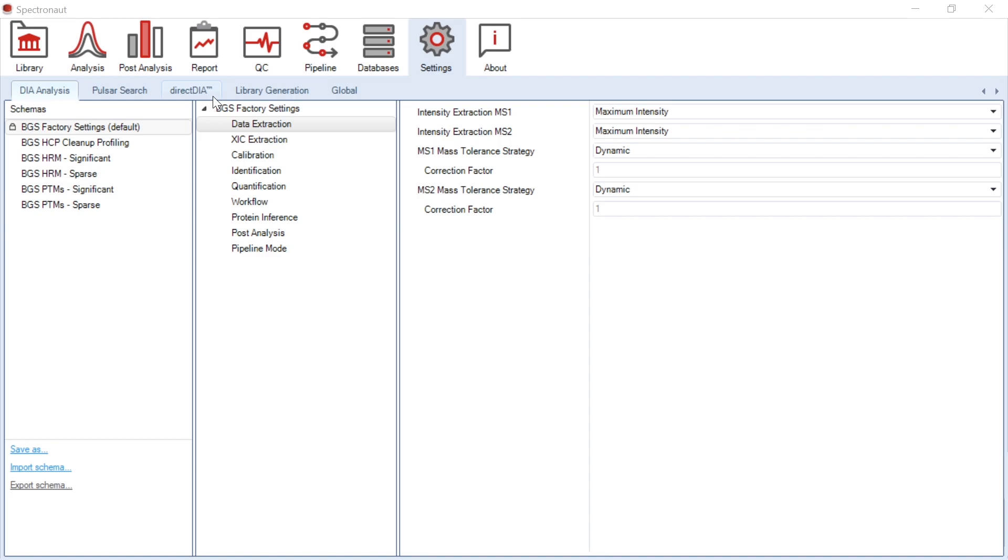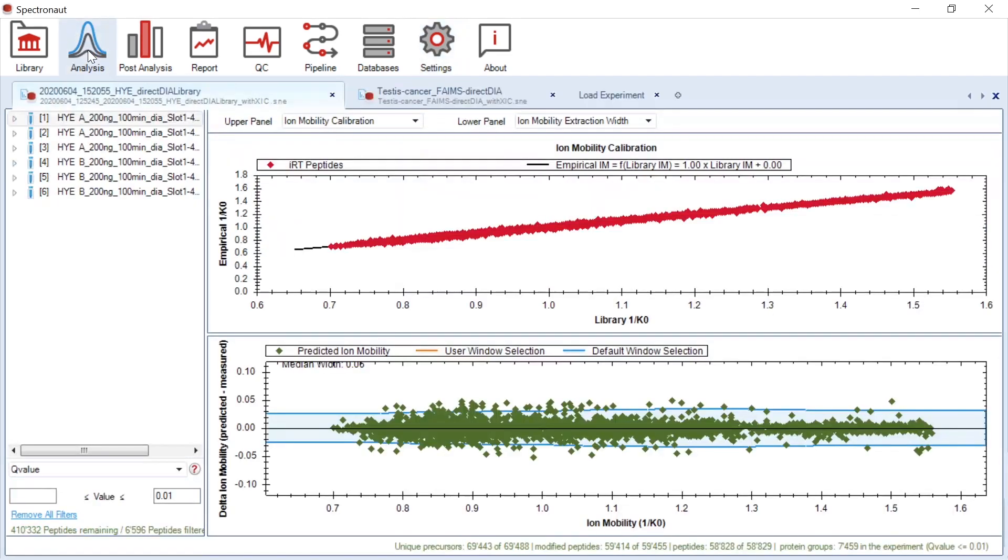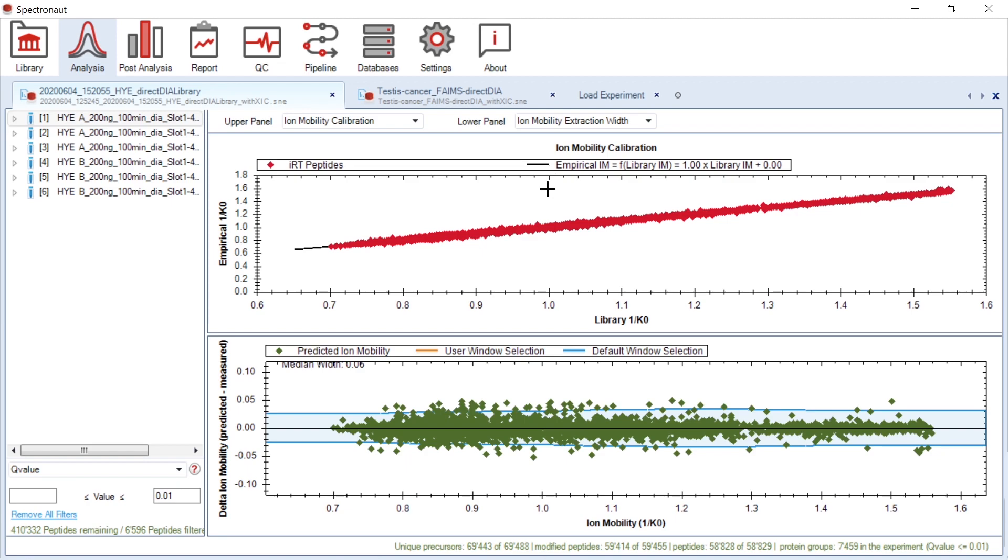For the technologies applying ion mobility as dimension, a number of graphical visualizations are available in Spectronaut. I would like to show you now what they are referring to and what you could read from them. The ion mobility calibration plot shows the empirical ion mobility as a function of the ion mobility values in the library. IRT peptides are marked with red color.